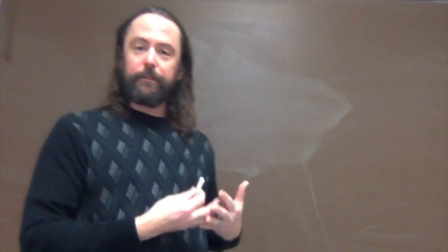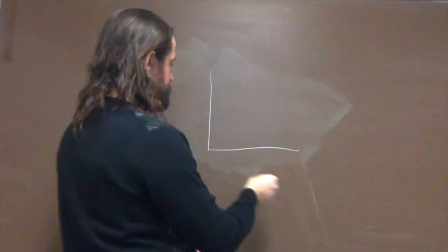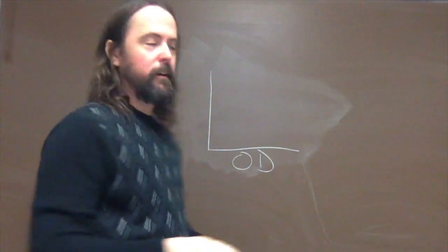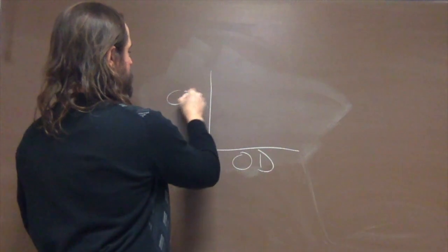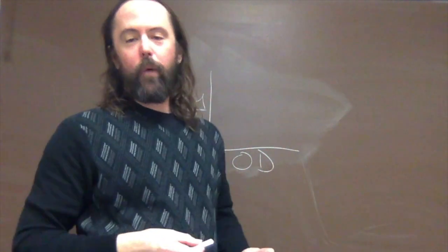With a standard curve, we're going to have a culture, and we're going to dilute it several times. We're going to measure the optical density for each one of those dilutions, and we're also going to plate them to see how many cells per milliliter are in each one of those diluted solutions. We're going to plot that this way. So we'll have our optical density on the x-axis. We're going to have our actual measurements of colony-forming units per milliliter on the y-axis.